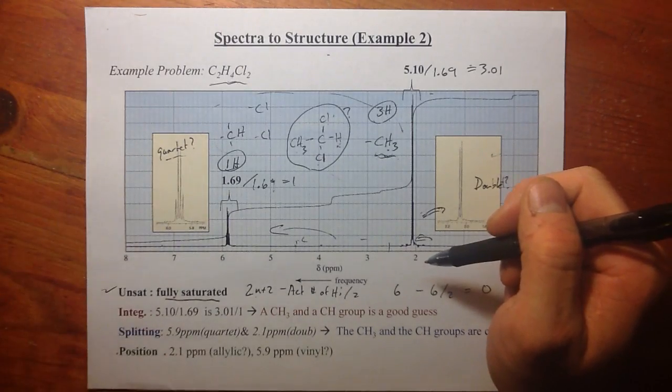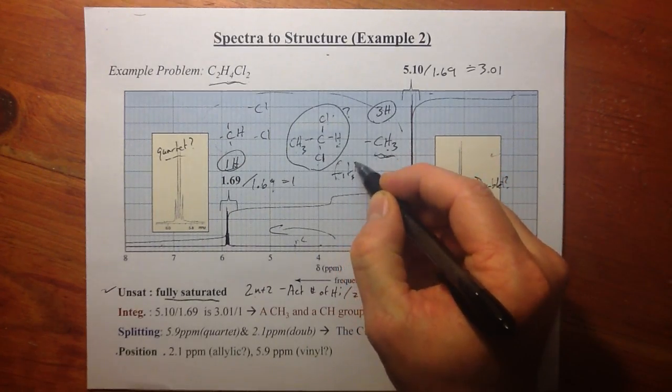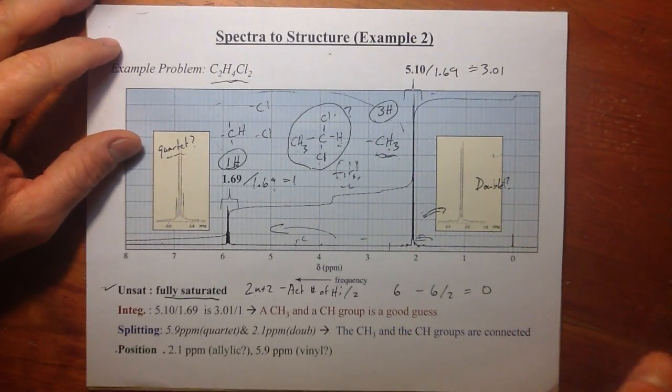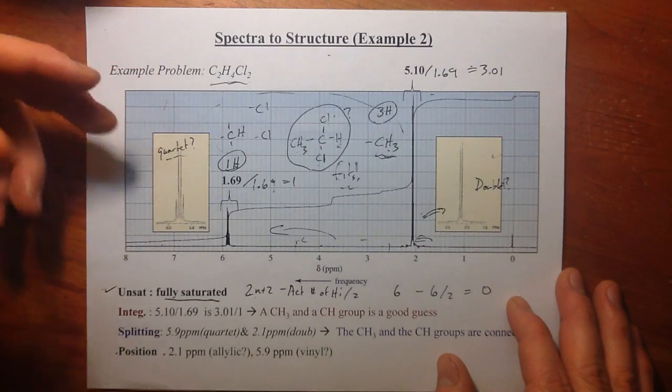We could try others, but I think you'll find you can't come up with anything better that fits the data. Alright, well that's it. I don't want to have this video be too long. That's the game we can play in going from spectra to structure.